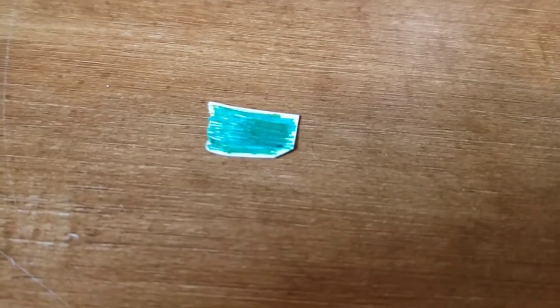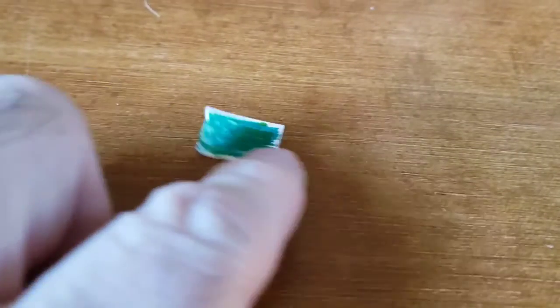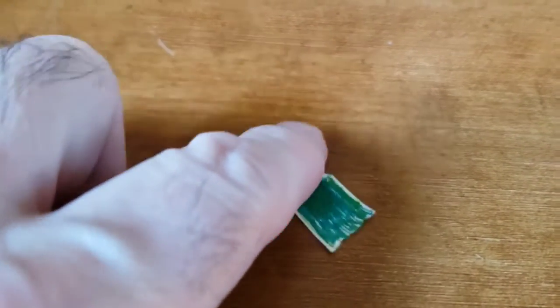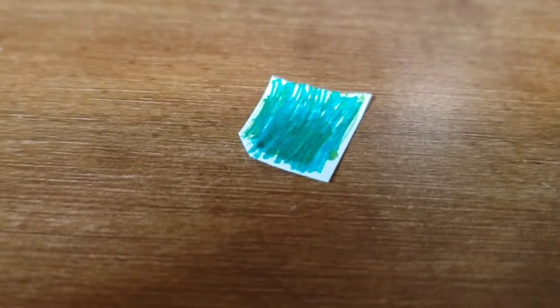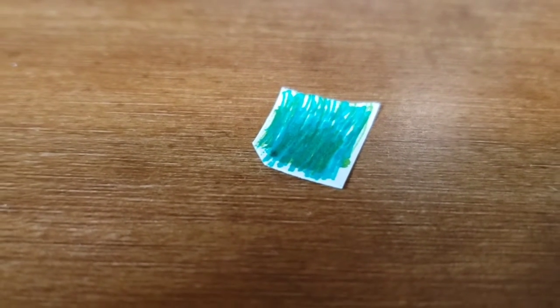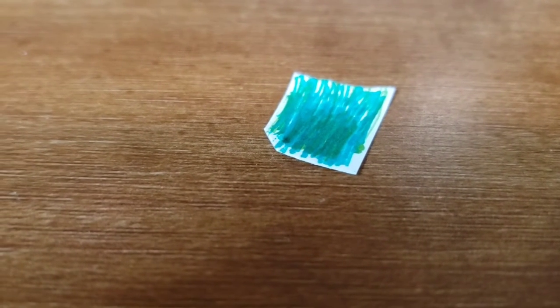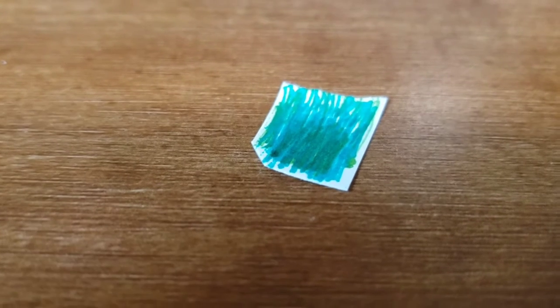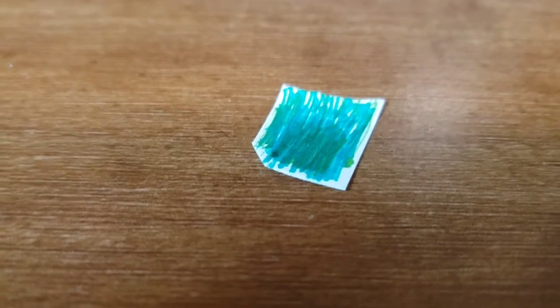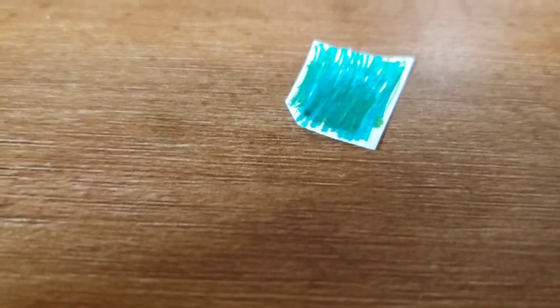So here's a forensic application of spectrophotometry. At a crime scene, I've discovered a small piece of colored paper. This could be from the wrapper of a piece of explosive. It could be ink from counterfeit banknotes. It could be from a threatening letter. It could be all sorts of different things. It could be the paint chip off a vehicle that's suspected to have been at a crash site.